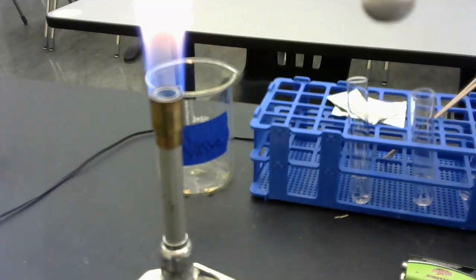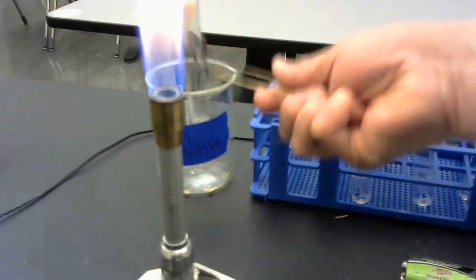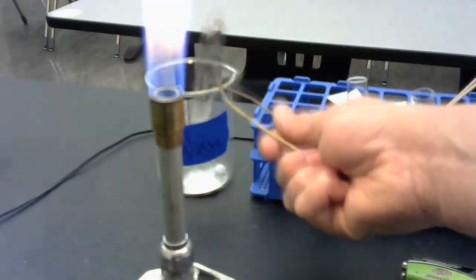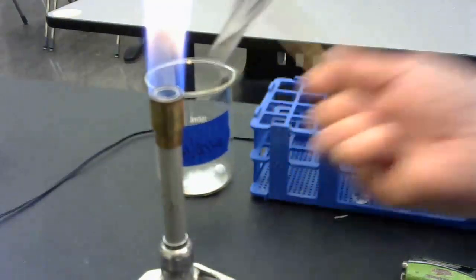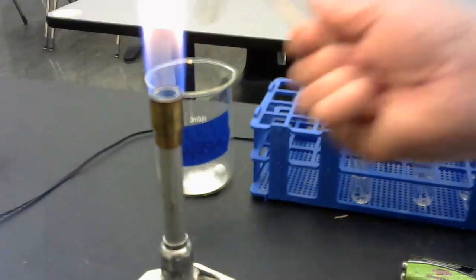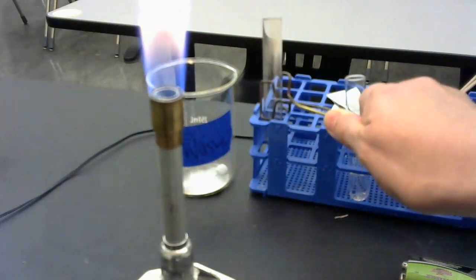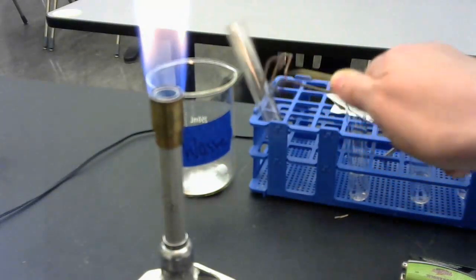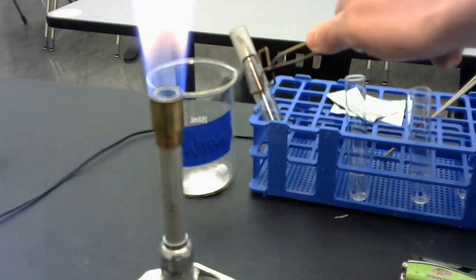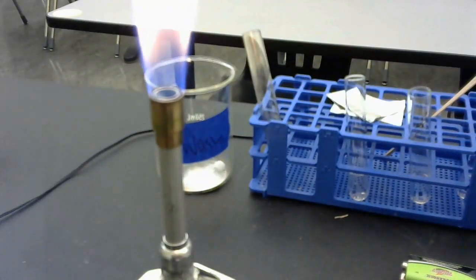And when you're finished with that reaction, go ahead and take that into your waste container and tap that out really well for me, because I'm going to refill these test tubes for the next set of classes. I'm just going to set that right there in the test tube rack. Don't touch the test tube. The test tube is going to be hot, okay?